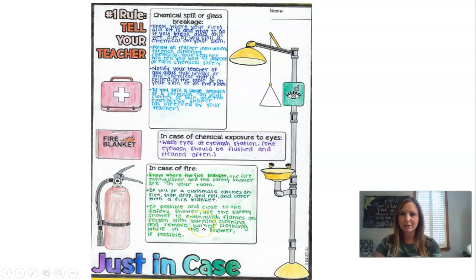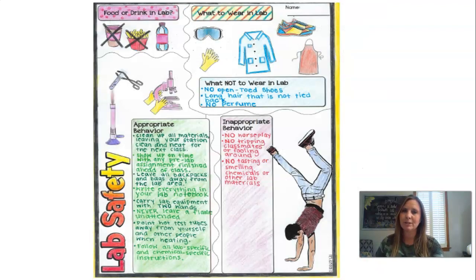This last one is talking about the shower once again, if that were the case. Once again, if you've caught yourself on fire with a hot plate, you were clearly not paying attention, and hopefully I would have gotten on you for not being a part of the group or paying attention way before you caught yourself on fire. But you never know, so the rule is there.